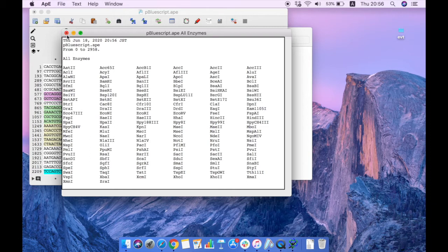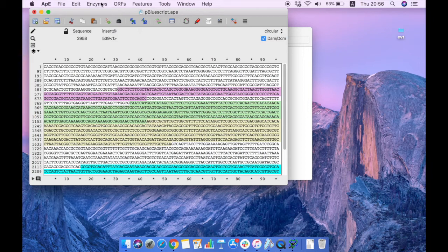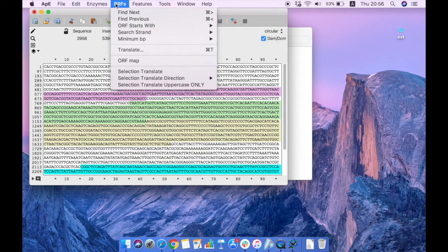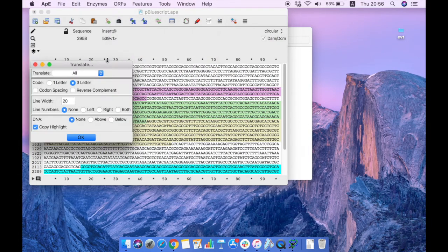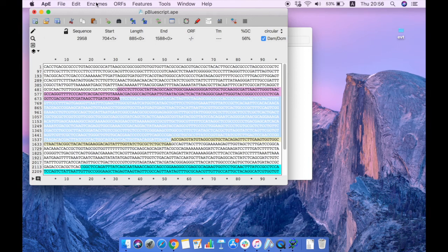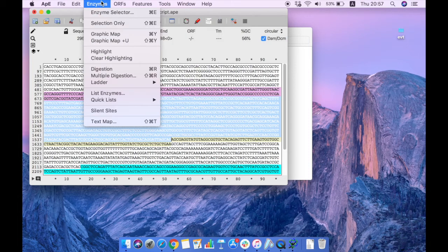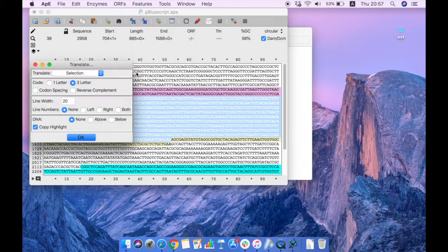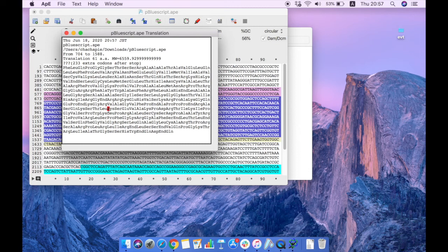Next, if you want to translate the sequence into protein, click Translate. You can select a specific portion to translate, or click Translate All to translate the entire sequence. The full translation doesn't reflect real biology, so it's more useful to select a specific portion, then click OK. This shows the translated protein sequence for the selected region.